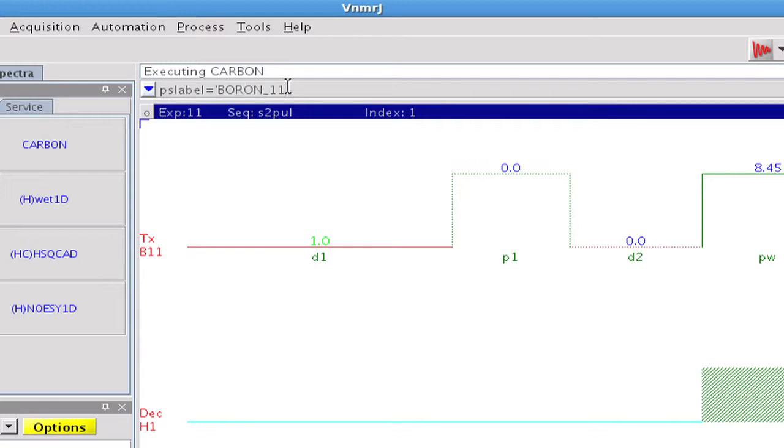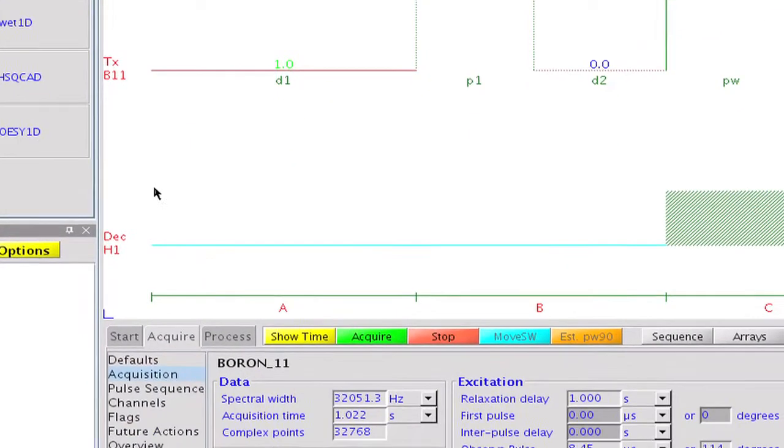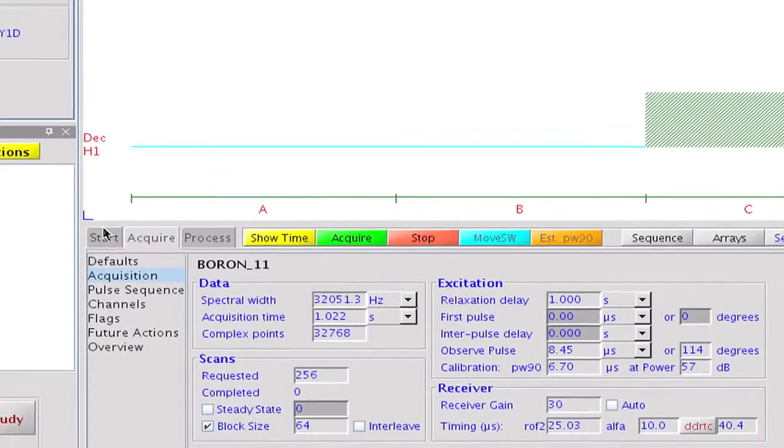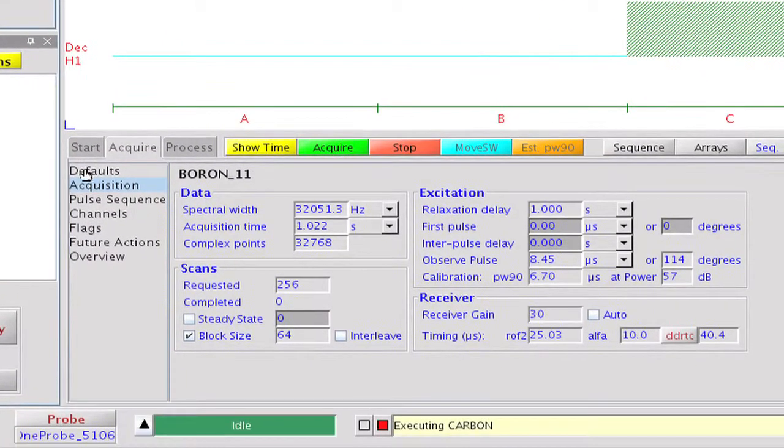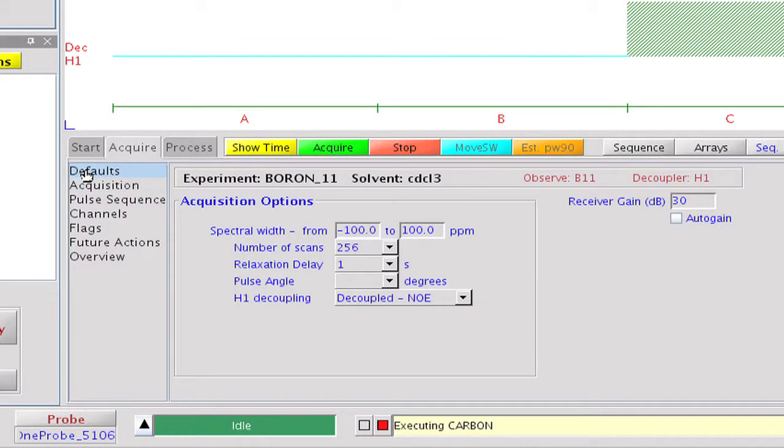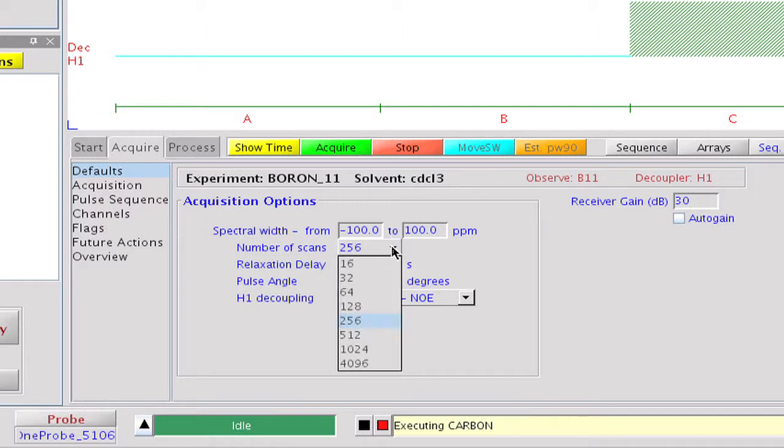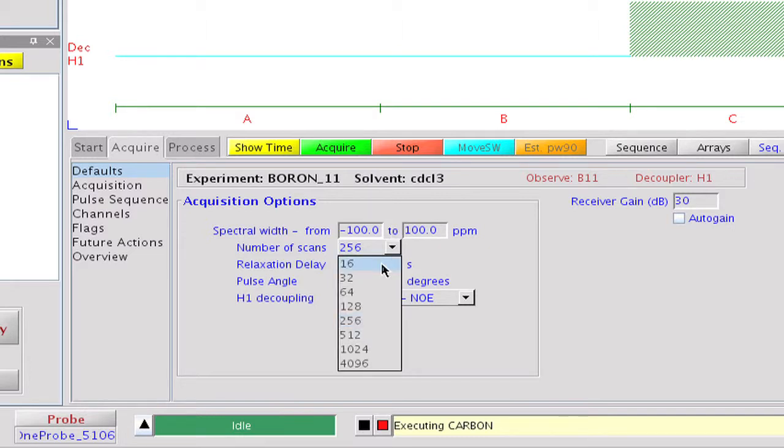We set the pulse sequence label to boron 11 in the command line. This is more representative for the acquired data than the name of the pulse sequence, which is nucleus independent. The spectral range of plus or minus 100 parts per million may be just fine. Boron 11 is significantly more sensitive than C13, so we can decrease the number of scans to 16.